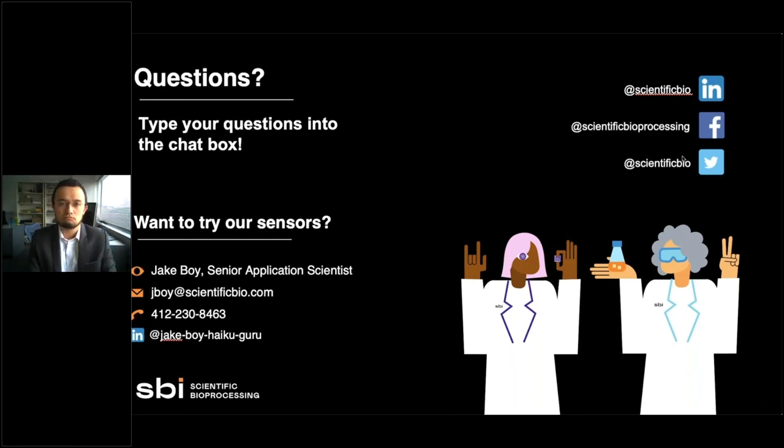We have ideas similar to what Daniel just mentioned. One potential, I've heard of people using glass fiber optic needles and then taking the measurements optically using something like that, but again, it would be the same thing. You have to stab the spheroid essentially to get that measurement. But as far as I know, there's not a widely known or widely accepted way to measure the inside of these things right now.